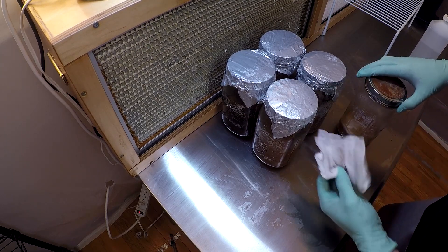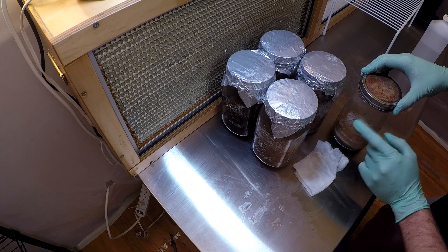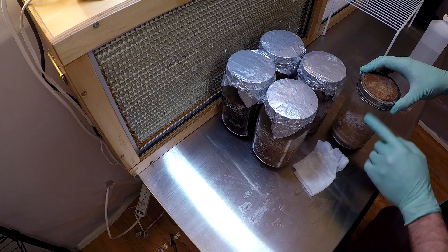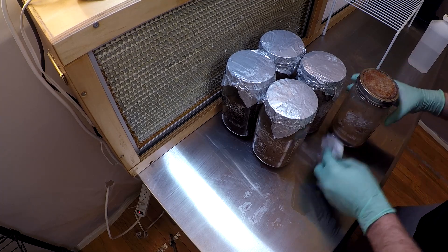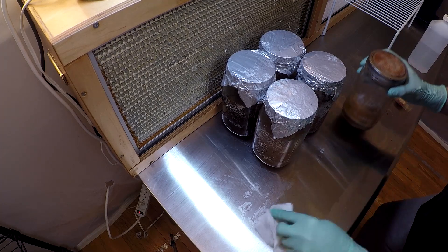You'll notice that this isopropyl alcohol wiped off the label and date that I had with the permanent marker on this jar. So make sure that you remember what you're using — either write it down or have a good mental memory of it. That way you can keep track. You don't want to mix things up because I've done that before and it's a big hassle down the road.